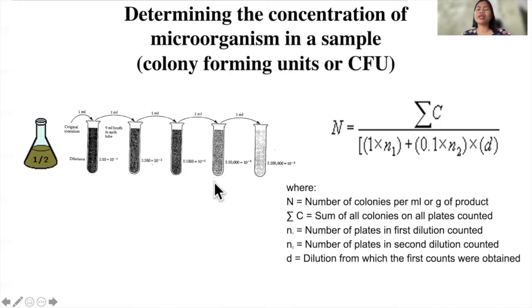And then you also take 0.1 ml in the next dilution here, and then plate it out, no, in 3 Petri plates or 3 nutrient agar plates. Ayan. So ayan, and then you take another here, tatlo na naman na plates, and then you take another 3 plates for this, no, 0.1 pa rin, 0.1 ml, at ipi-plate out mo hanggang makompleto mo siya.